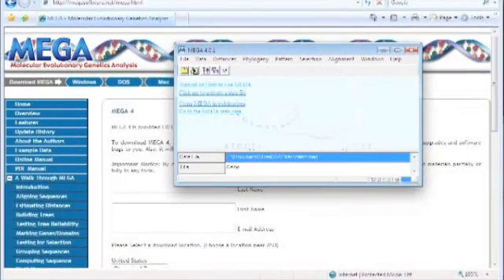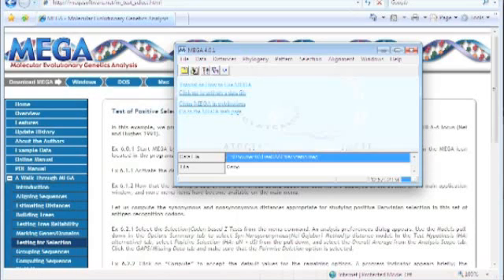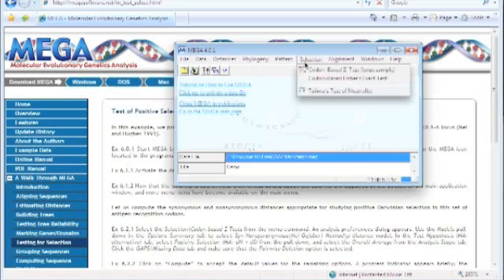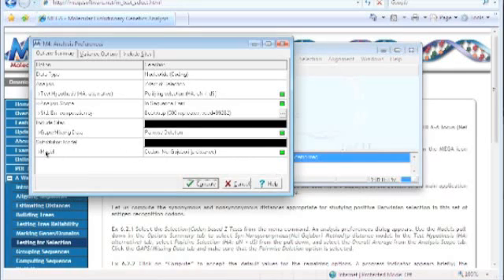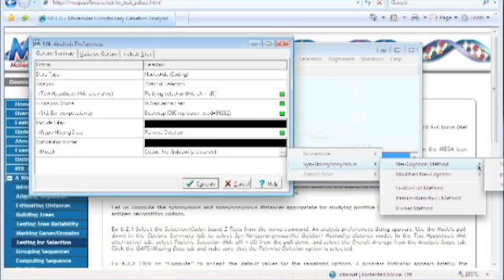What we're going to do now is find the dN/dS ratio, which is the non-synonymous and synonymous rates comparison. To find the dN/dS ratio, we go to the Selection menu item, select the CodonBasedTest, and the model we're going to be using is right here — the p-distance model.